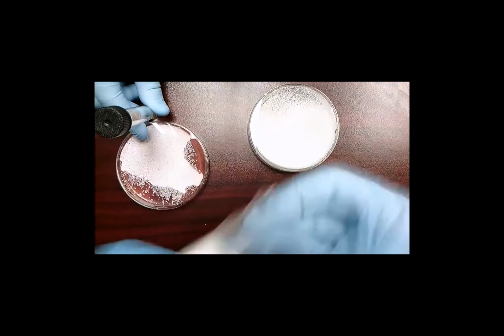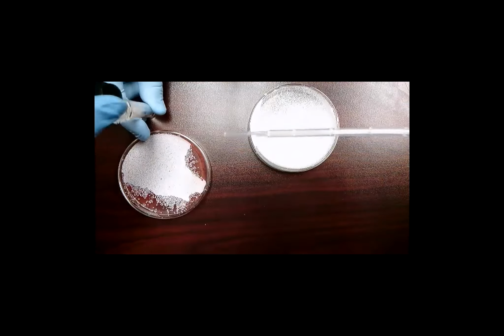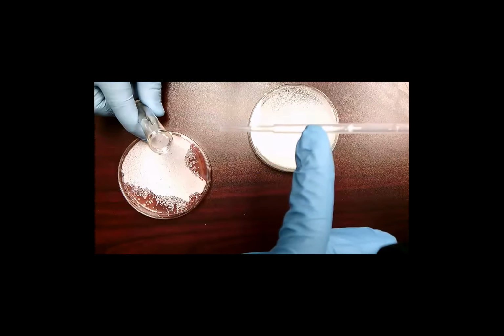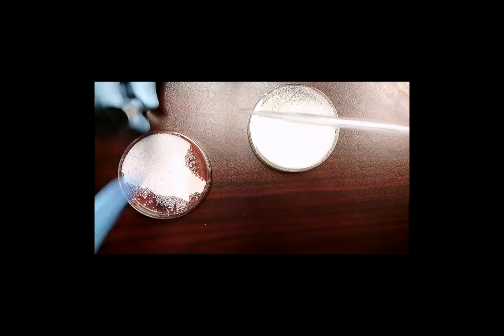And you're going to use a new micropipetter every time for every plate that you do. So you take it out, try not to touch anything with it. You are then going to open your test tube. You are going to fill it with water to 250 microliters, which is about where my finger is. If you buy the Carolina kit, it tells you exactly where. And it actually says it in little teeny letters on this pipette. So you'll push the bulb down, try to go in the center. You'll get about 250 microliters in the pipette.